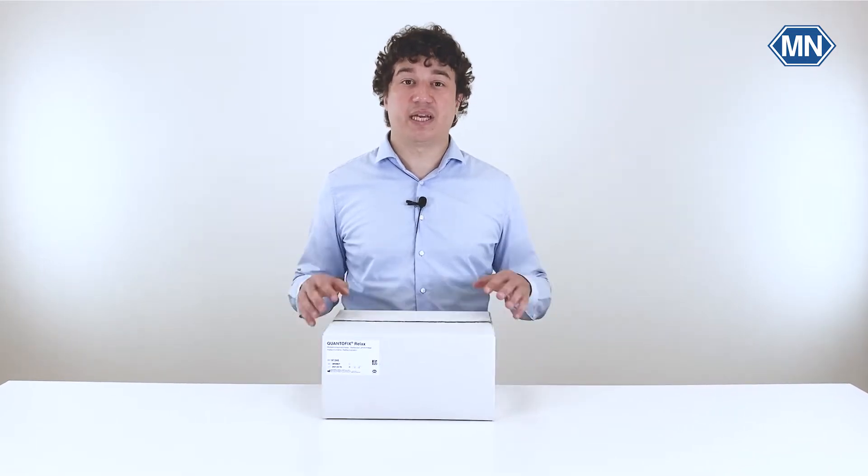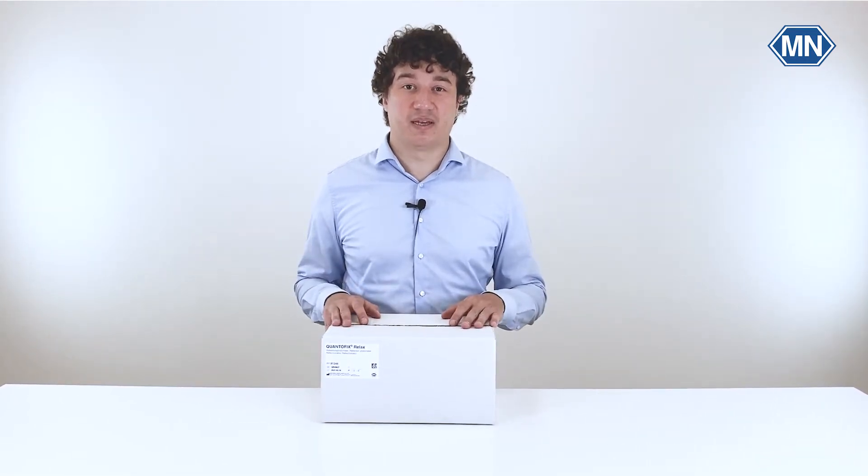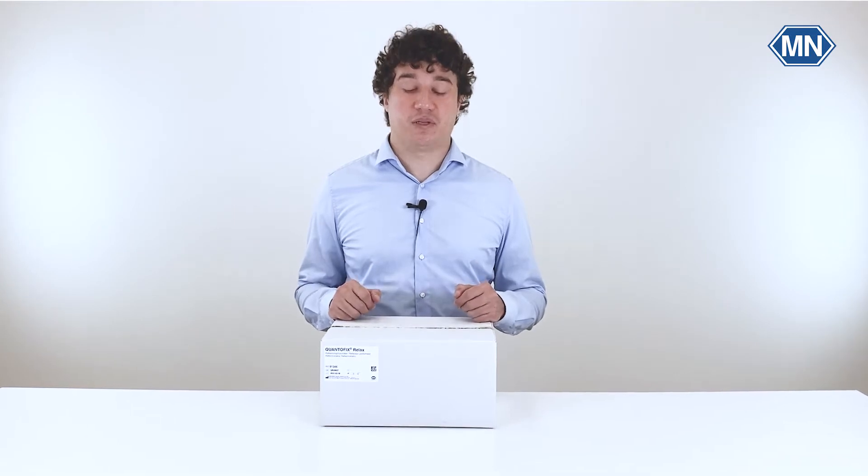Hello everybody and welcome to our next unboxing video. My name is Danny and today I will present to you our Quantofix Relax, a mobile reflection photometer for the evaluation of Quantofix and PHFix test strips. I will also show you what you get if you buy this device from Machrae Nagel or our official distributors. So let's head right into it and see what's inside the box.